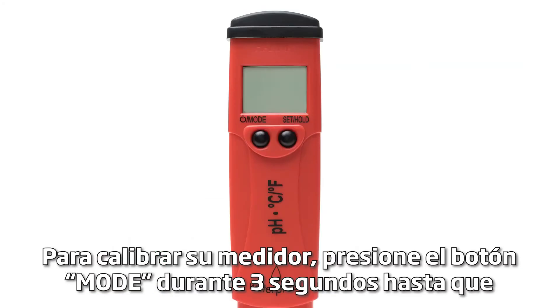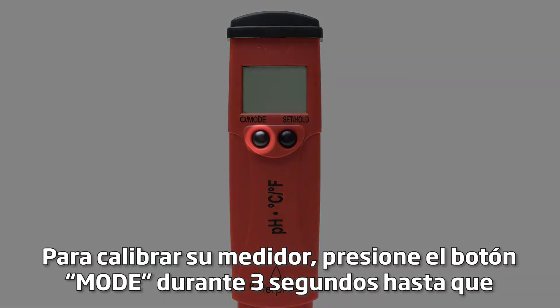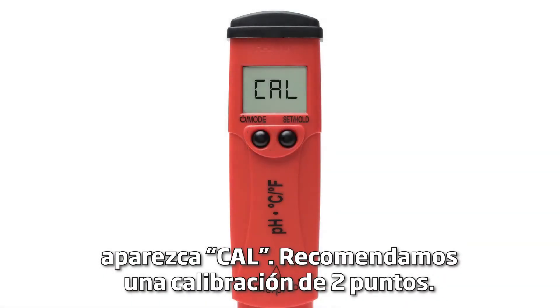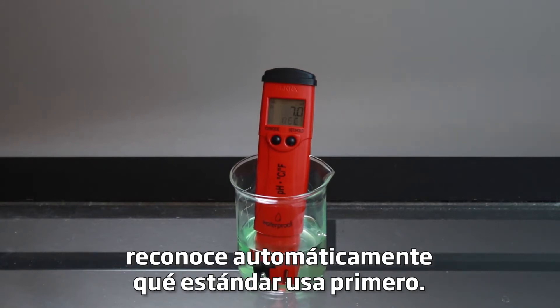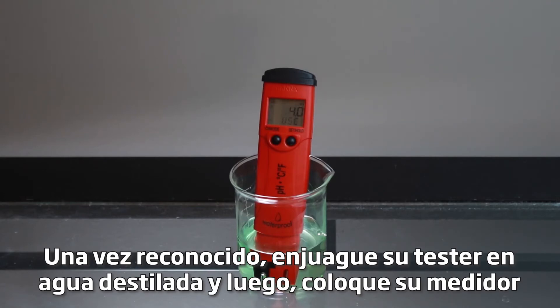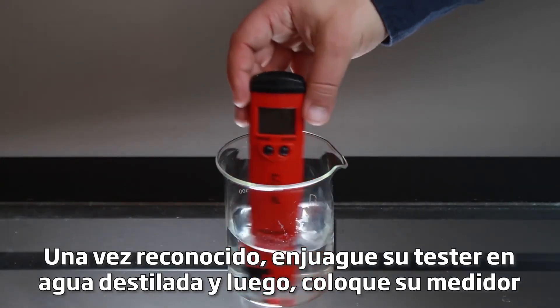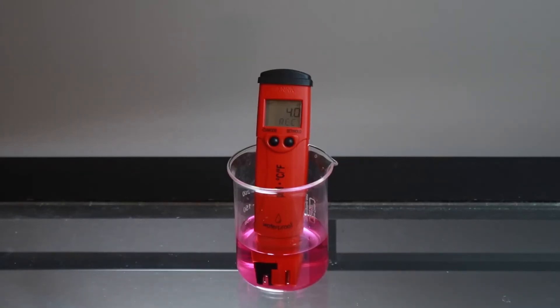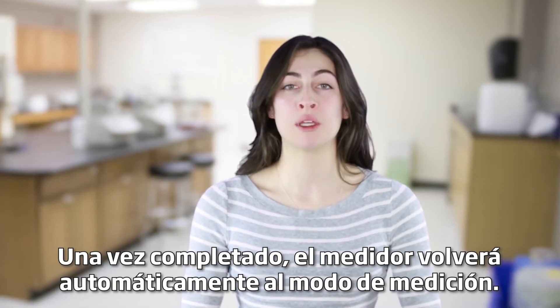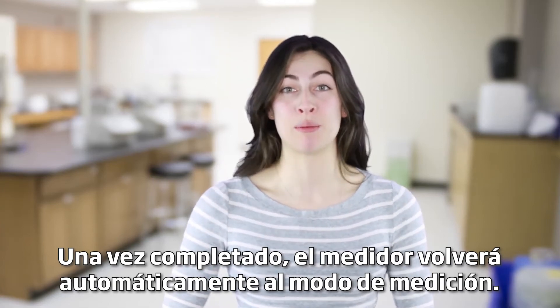To calibrate your meter, press the mode button for three seconds until 'cal' is displayed. We recommend a two-point calibration. Place your electrode in your HANA pH calibration buffer. Your pH tester automatically recognizes which buffer you use first. Once recognized, rinse the tester in distilled water, then place your tester in the next buffer. After it's complete, the meter will automatically return to measurement mode.